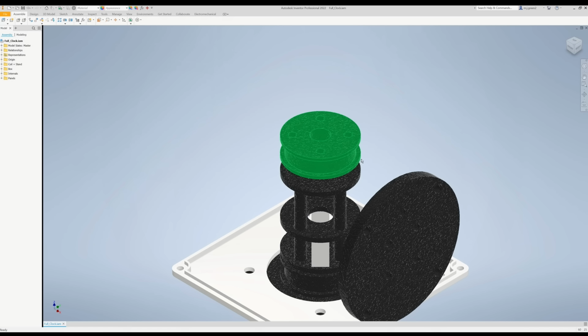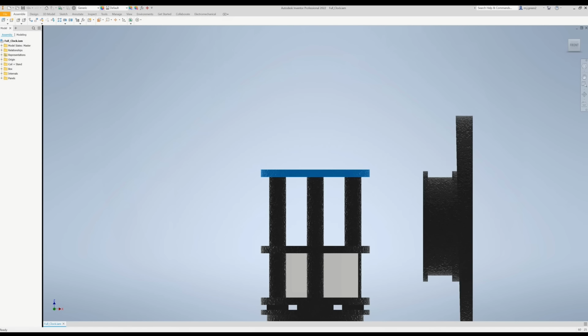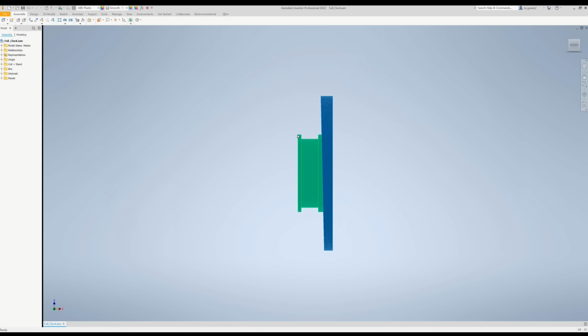We can look at each of the parts for containing the coils and shifting up and down the resonators, and we can even highlight specific ones to look in more detail. The program allows us to put precise details into our designs, for example on the modulation coils, which normally look flat from an outside perspective, but you'll see clearly that there's an angle on them that needed to be added when designing to account for the box's shape.